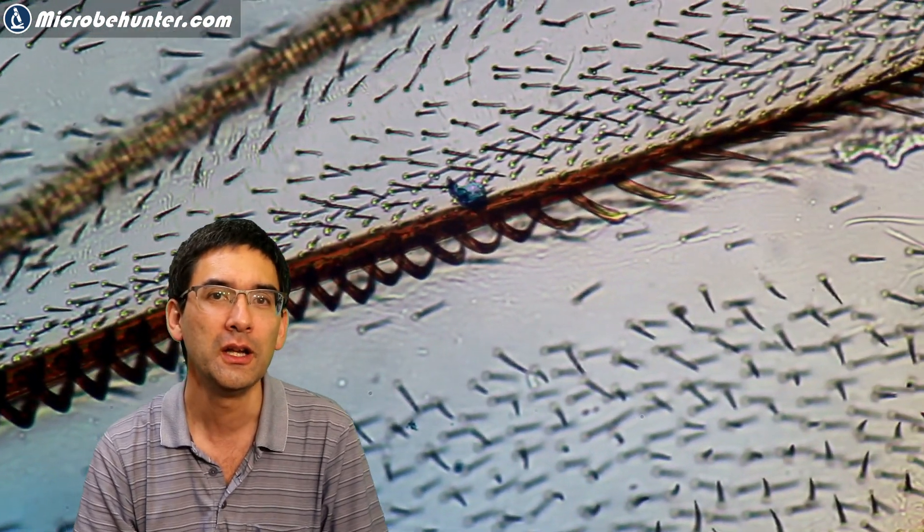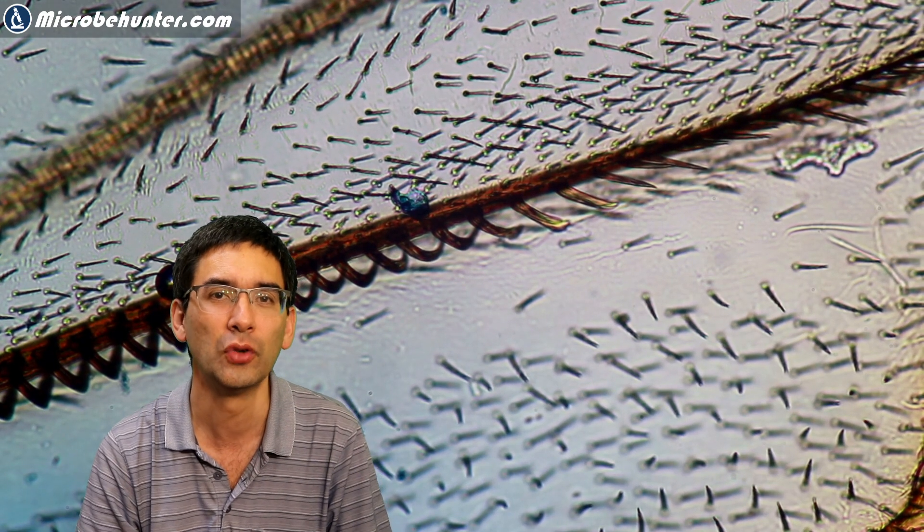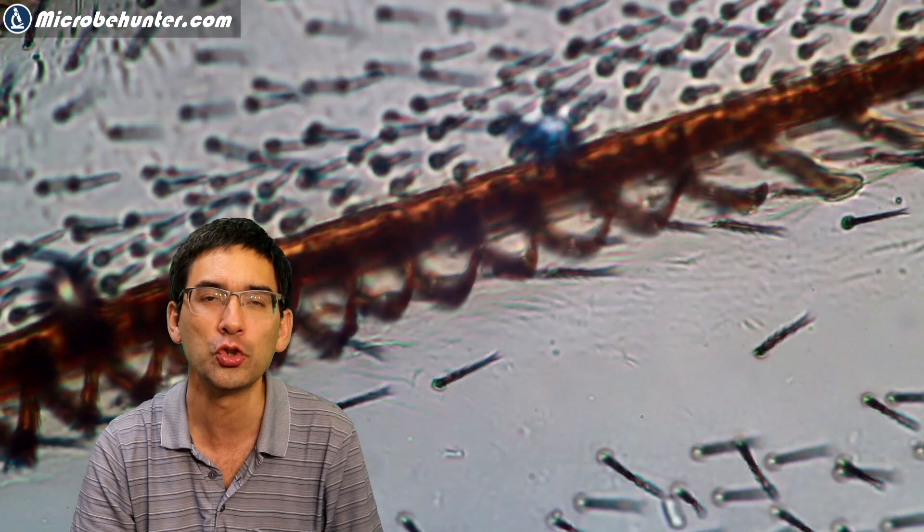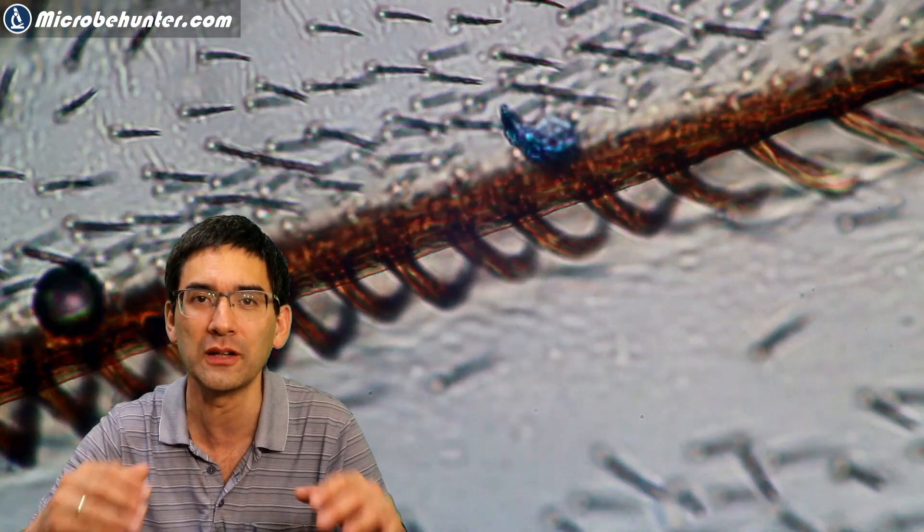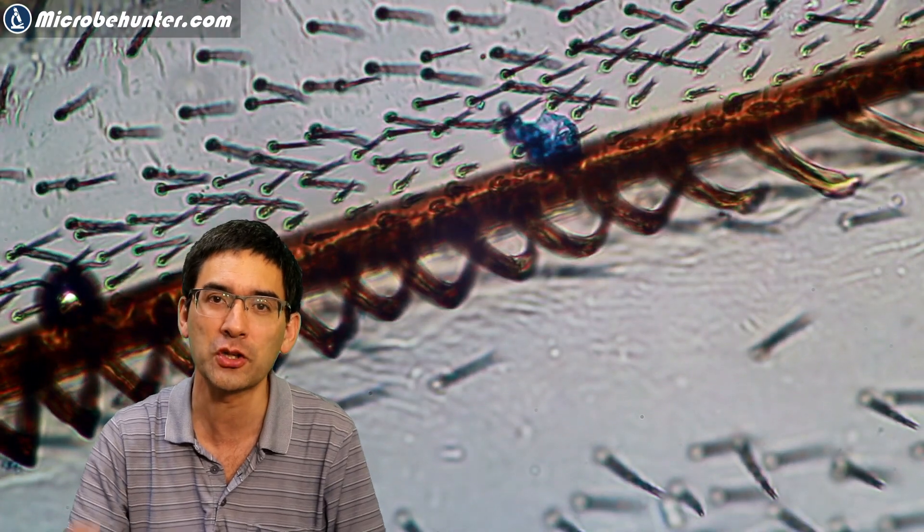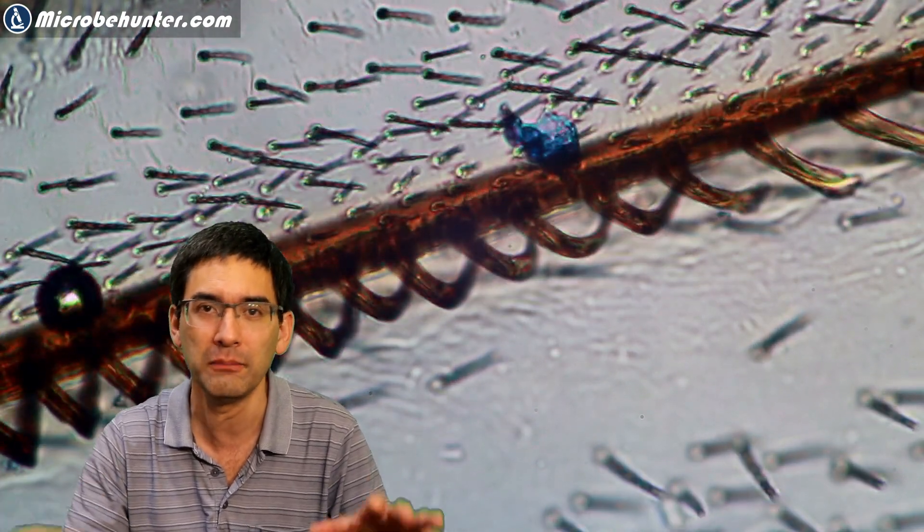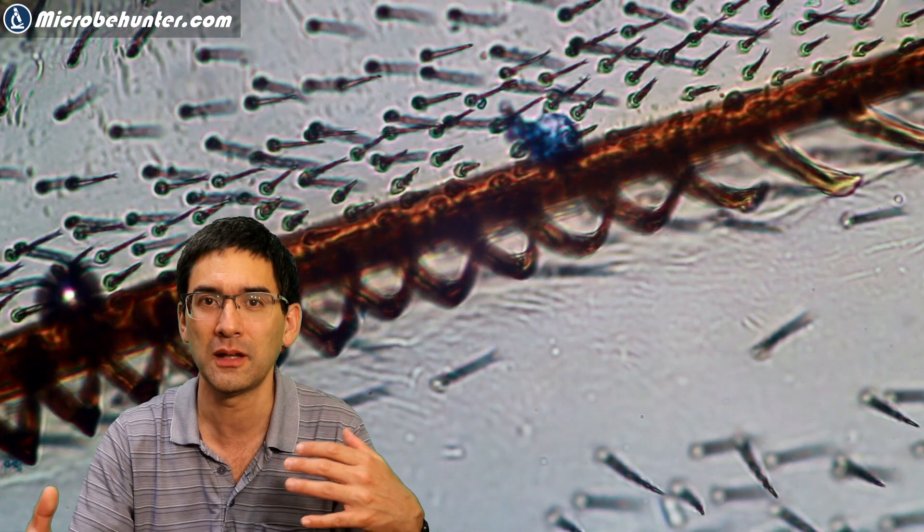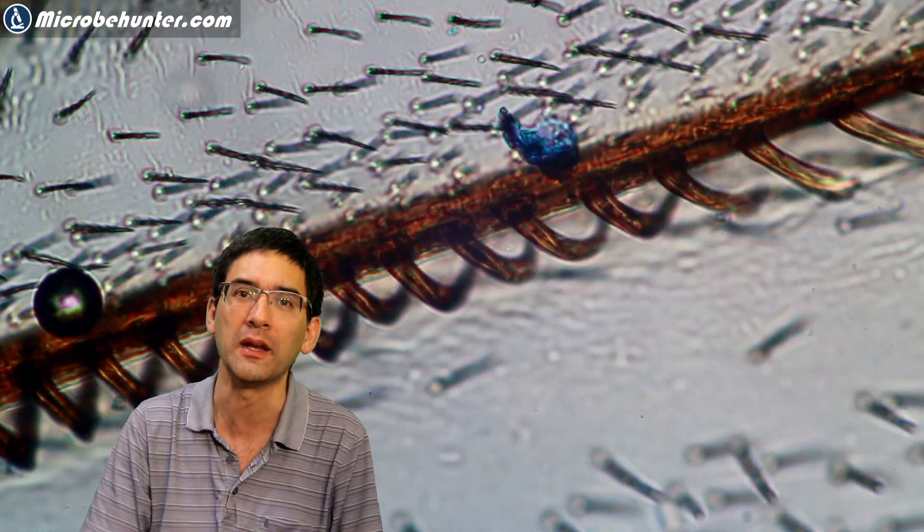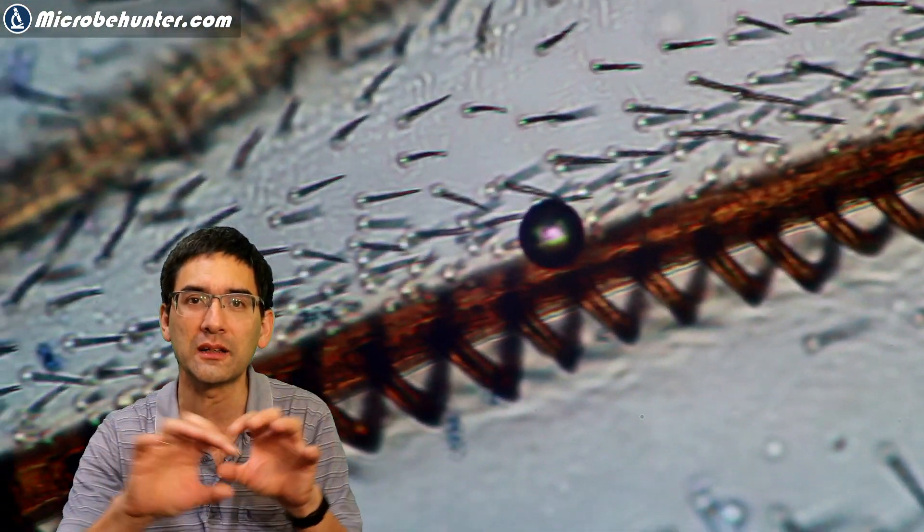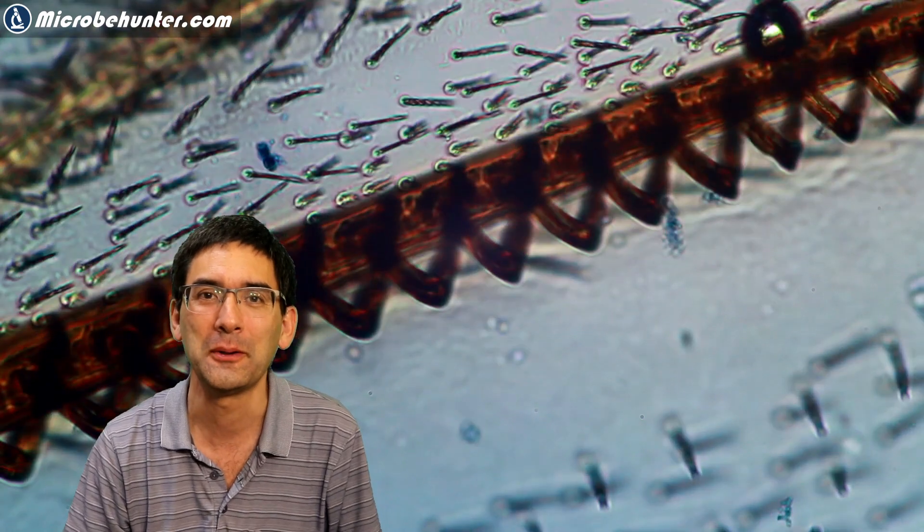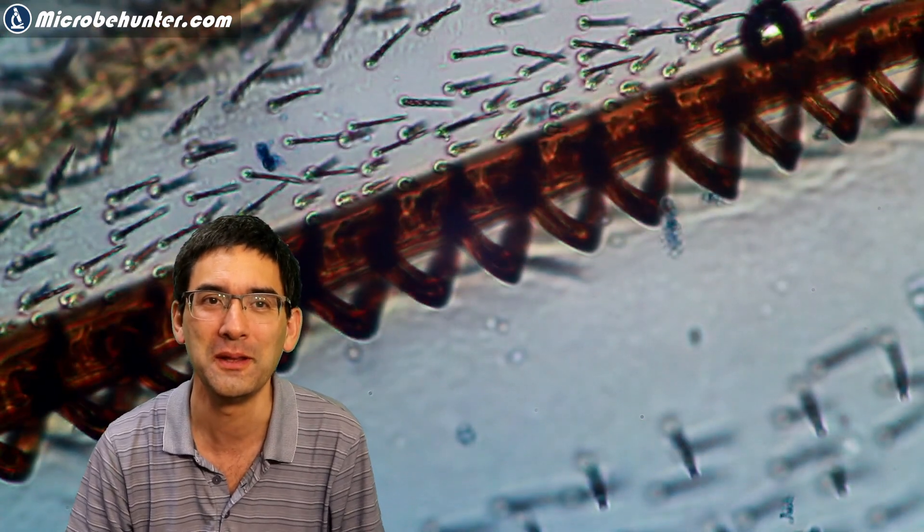And if you look very carefully here, right in the center, you see this row of little tiny hooks. And these hooks, they are joining the front and the back wings. So they're kind of interlocked. So I think that the wasp actually flaps both of them in the same way. And that they basically act like one wing, one complete wing. And those little hooks seem to be there to connect the front and the back wing. At least that's what I assume, because otherwise, why would they be there?